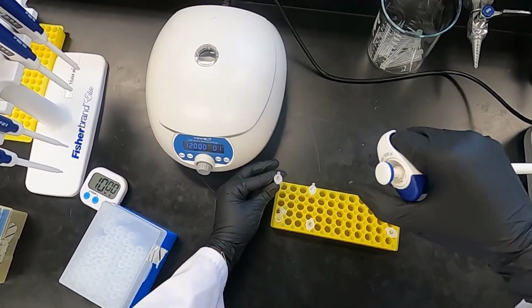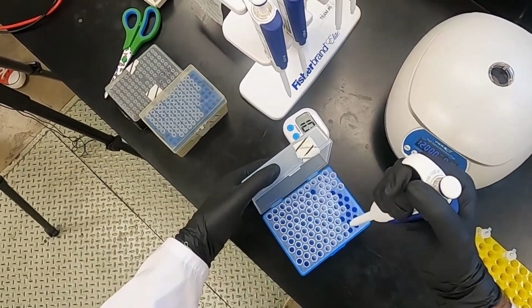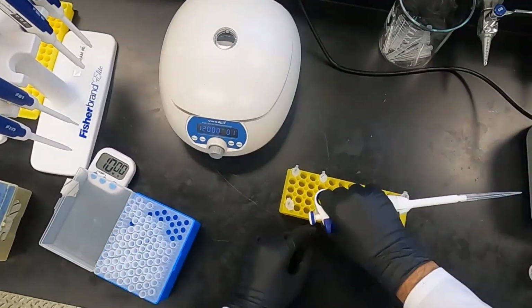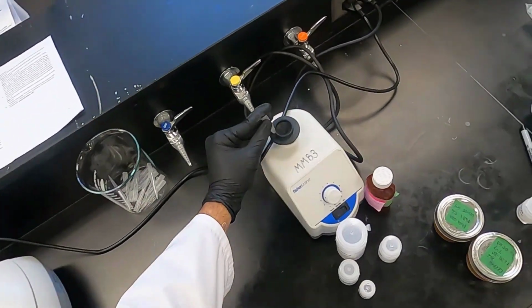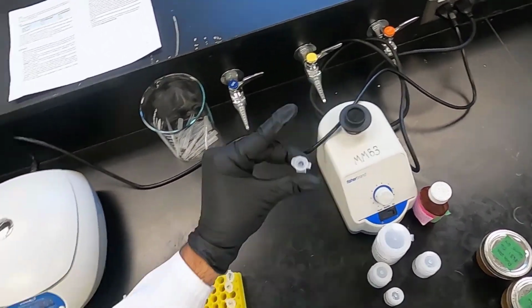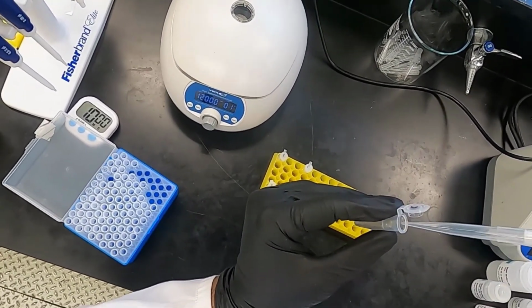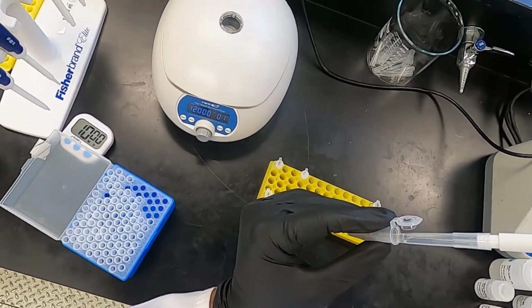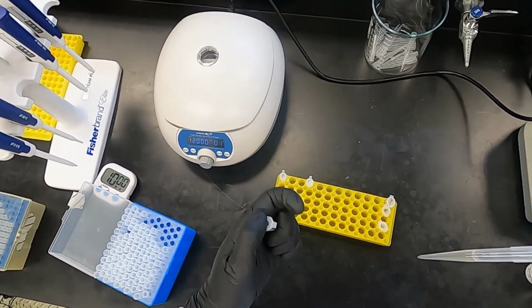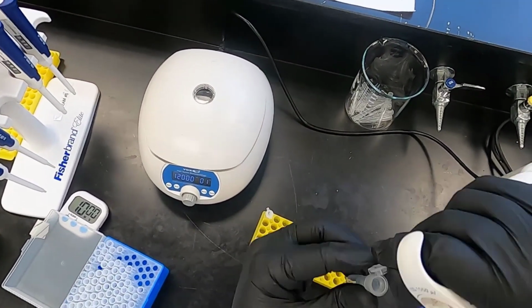Close this out for now. Then we're going to go to our second sample. Vortex to make sure everything is homogenized and any precipitated DNA will be collected. Next to the second spin column.